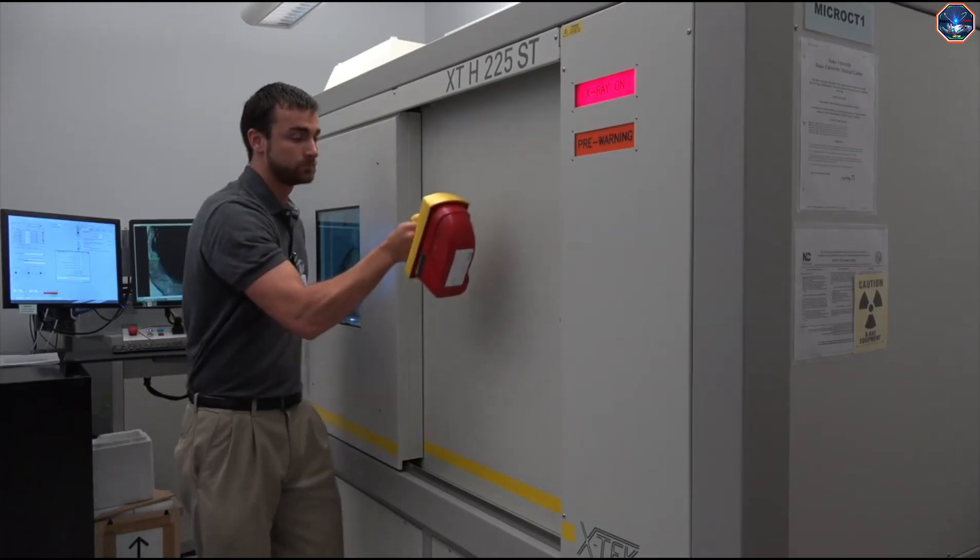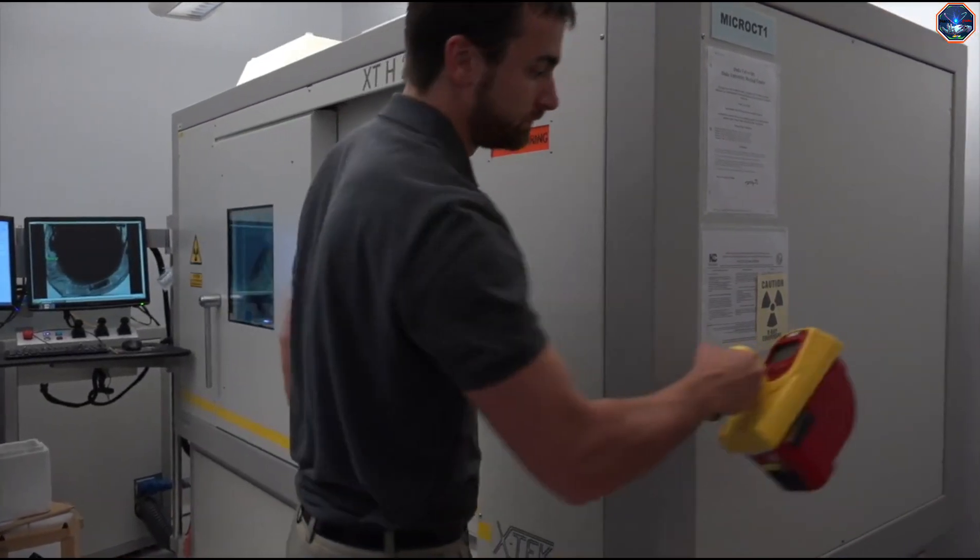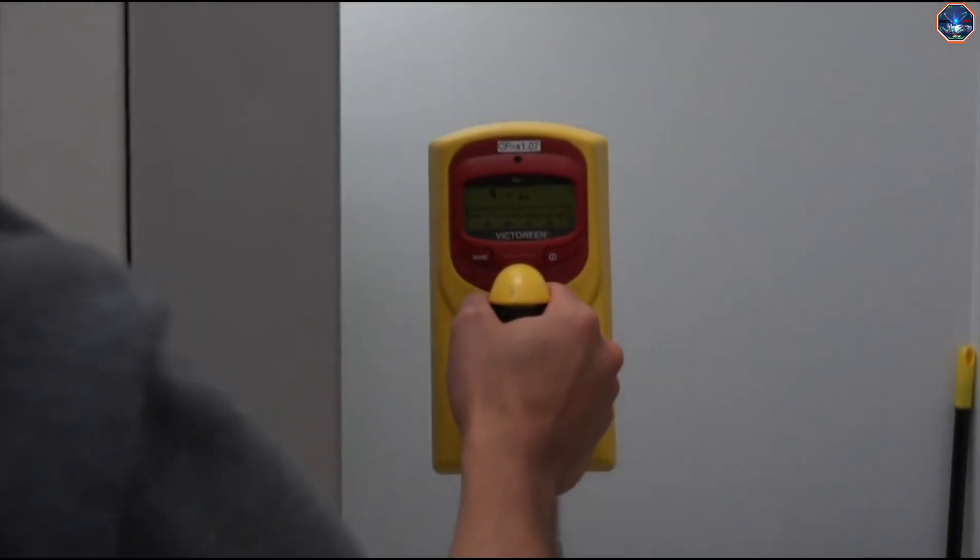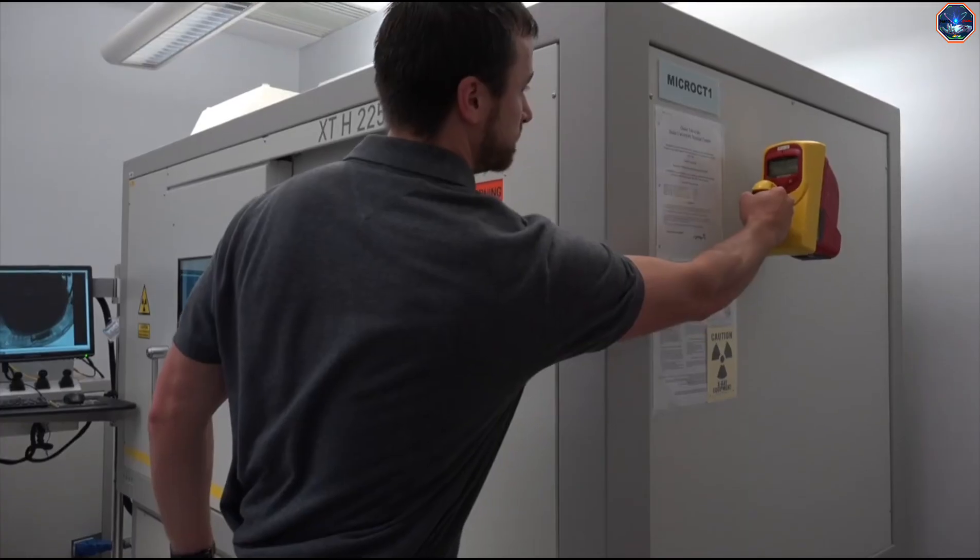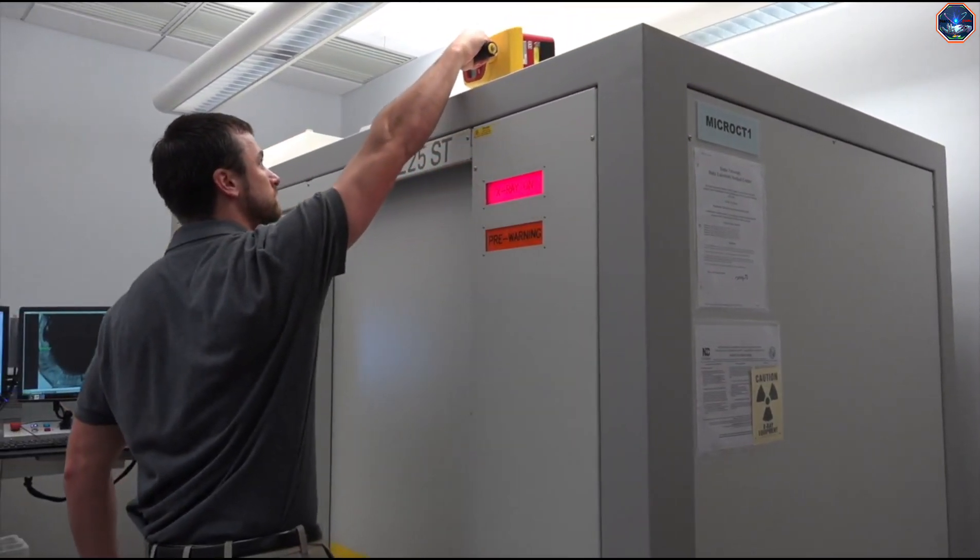Finally, x-ray safety training is required and regular safety inspections are made of the equipment. Because of all the safety features and protocols, no extra protective equipment needs to be worn when operating the MicroCT.